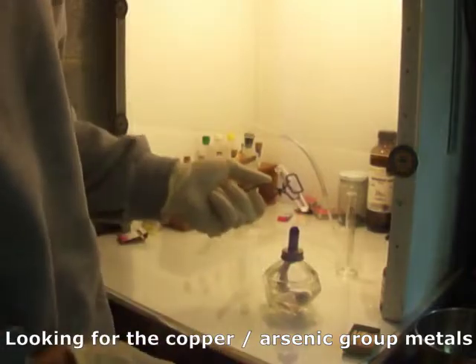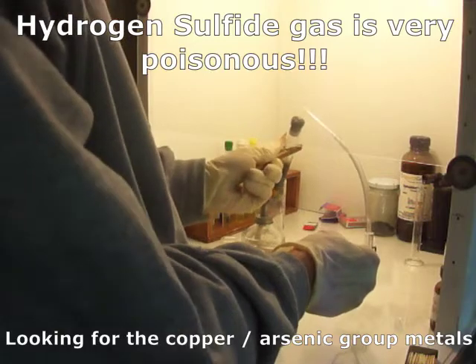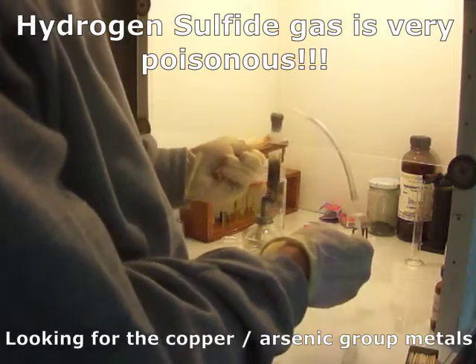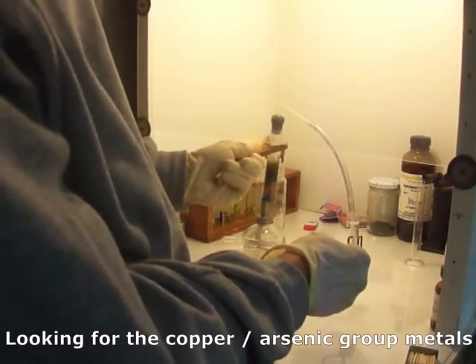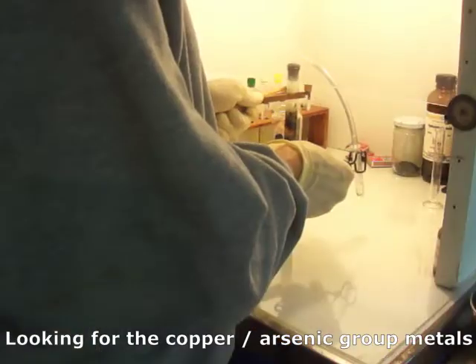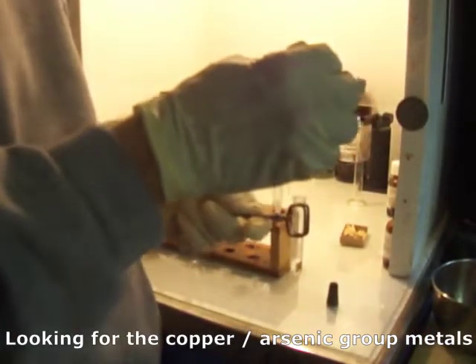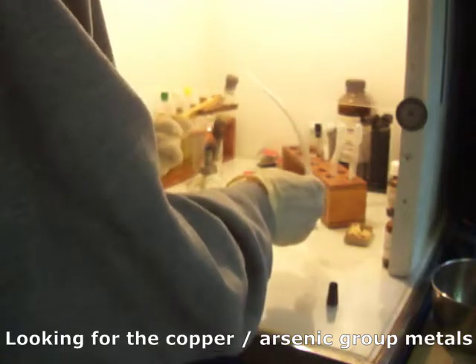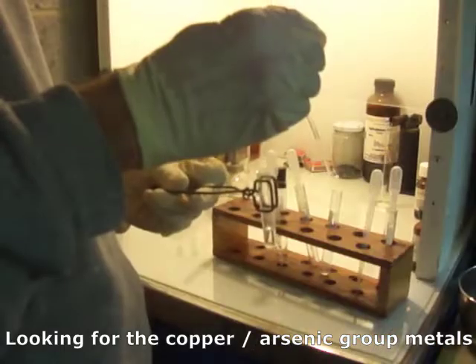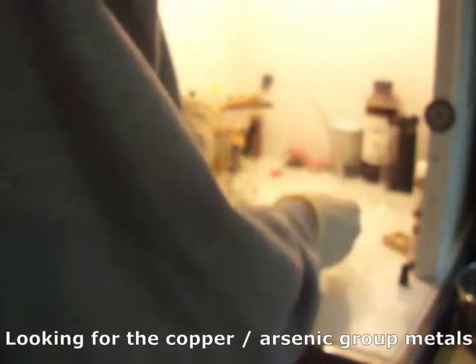Once it's transferred to the tube, we're supposed to heat till effervescence. Now we're supposed to treat it with hydrogen sulfide gas. This is a carbon, paraffin, sulfur hydrogen sulfide generator. It produces hydrogen sulfide gas when it heats up. Now we dilute with 10 drops of hot water and treat this for another 20 or 30 seconds with hydrogen sulfide gas. Now we add 1 drop of ammonium acetate, and we treat it yet again with hydrogen sulfide for another 20 or 30 seconds. Now we add 25 drops of cold water and treat it one last time for another 20 or 30 seconds with hydrogen sulfide.